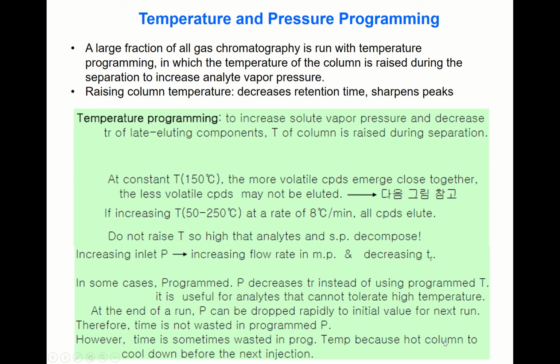Also in the temperature programmed experiment, you have to drop the temperature to the initial value after you increase the temperature here. But changing temperature is not rapid. It cannot be done rapidly. So you need more time for a temperature programmed experiment.